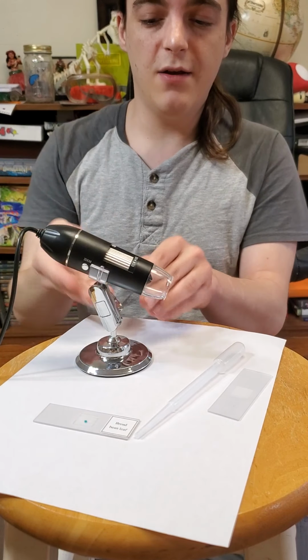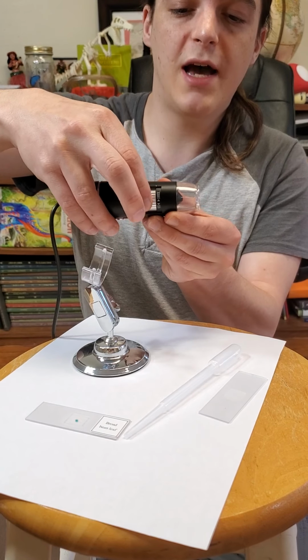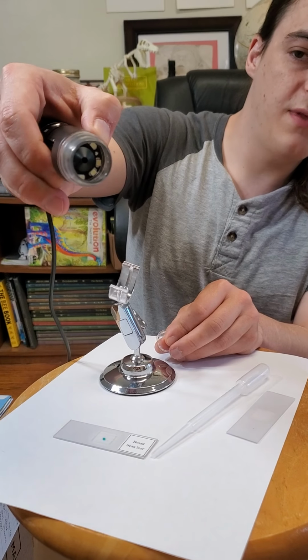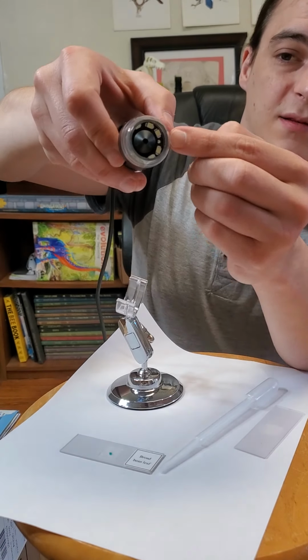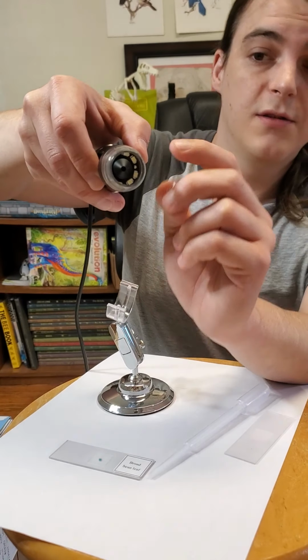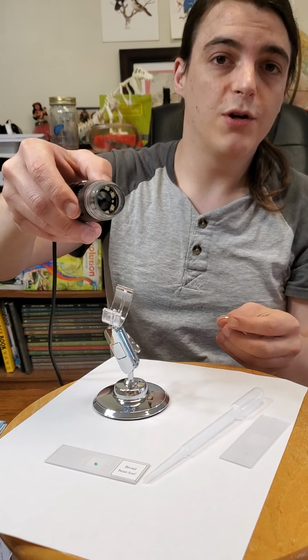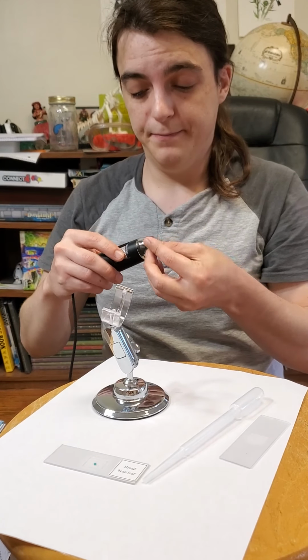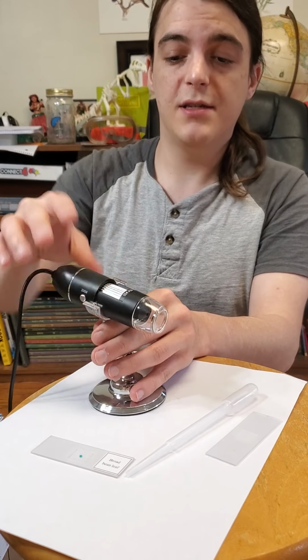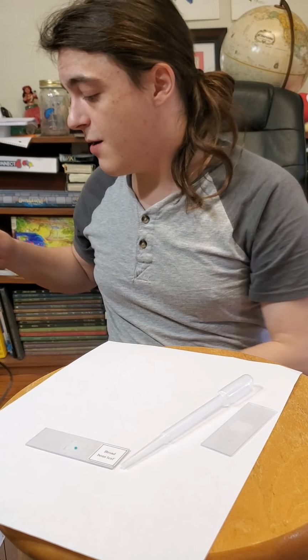I've got a little stand here that's basically our arm from the other microscope. I've got a little adjuster slider here. If you look, you can see how my lens moves in and out when I do that. And you'll also notice that I've got some little white spots around the outside. That's my light source. So those are LEDs, they're little lights, and they'll light up whatever we're trying to look at. It can get very bright. So I just snap that right into there. I'm going to use this digital microscope to show you guys some stuff in another video.